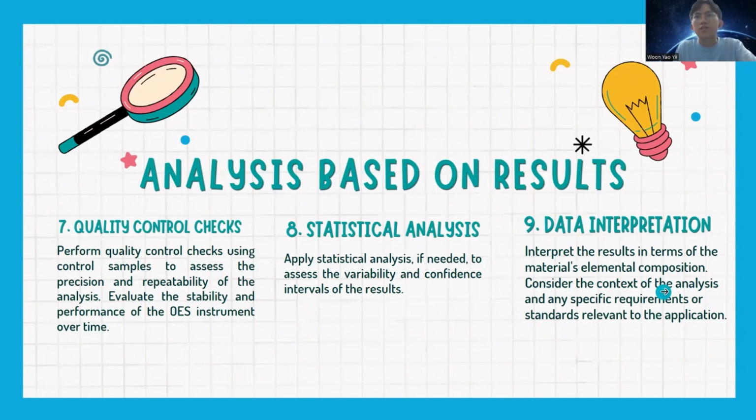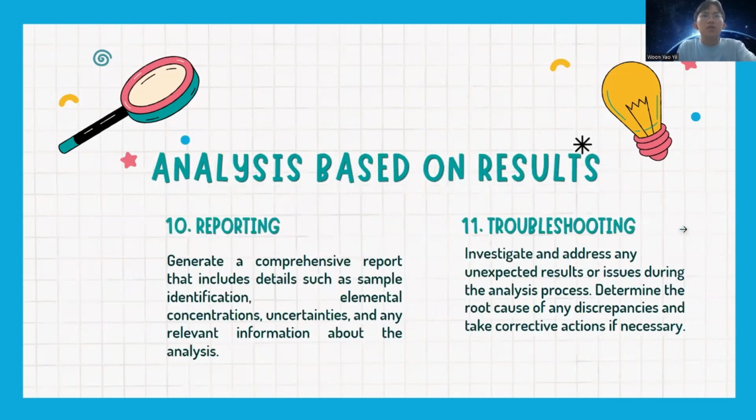The next step is the data interpretation. We need to interpret the result in terms of the material's elemental composition. Then we need to consider the context of the analysis and the specific requirements or standards relevant to the application. The next step is reporting.